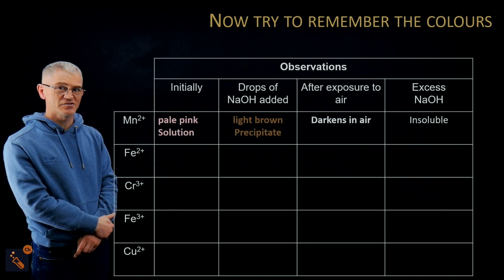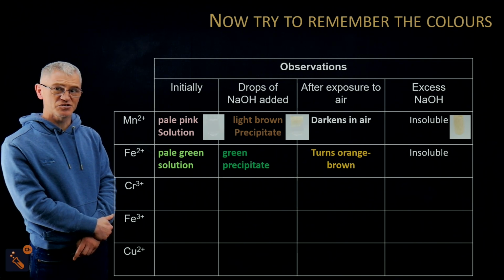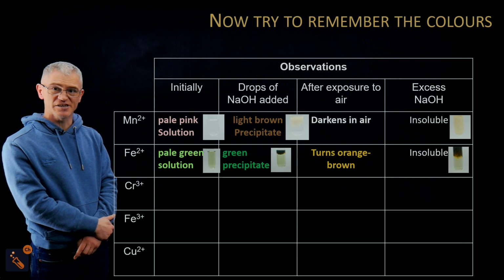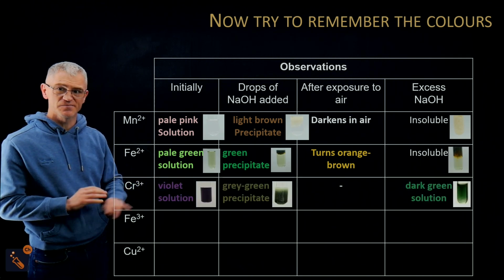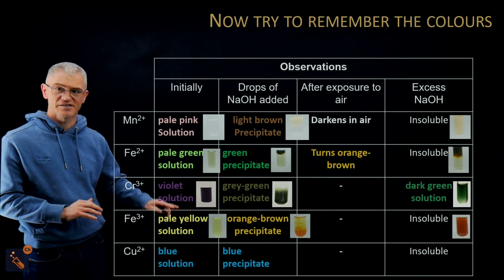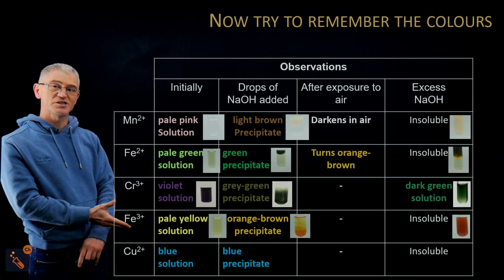So you've got pale pink to light brown. You have got pale green to a green precipitate, okay, and then turns orange-brown on exposure to air. And then you've got the violet going to the grey-green to the dark green. And then you've got the pale yellow, the orange-brown. Okay, and then you've got the blue to the blue precipitate. So there are all your precipitation colours.